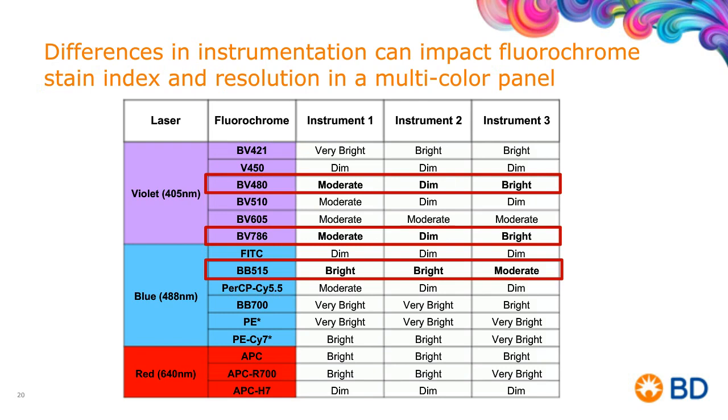And if you're lucky, there is an instrument on the analytical side that has a pair to a sorter. Because when you do that, it saves the time of having to rebuild a panel on a different sorter. So paying attention to that is really, really important if sorting or functional assessments are important in the work that you do too.